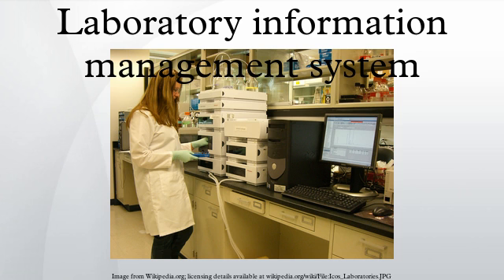personnel and workload management, organize work schedules, workload assignments, employee demographic information, training, and financial information; quality assurance and control, gauge and control sample quality, data entry standards, and workflow; reports, create and schedule reports in a specific format, schedule and distribute reports to designated parties; time tracking, calculate and maintain processing and handling times on chemical reactions, workflows, and more; traceability, show audit trail and/or chain of custody of a sample; workflows, track a sample, a batch of samples, or a lot of batches through its life cycle.